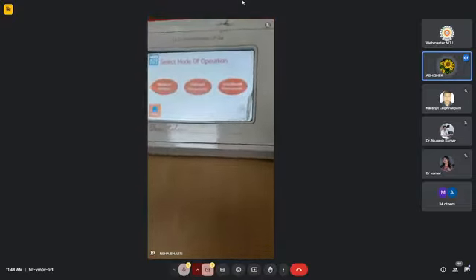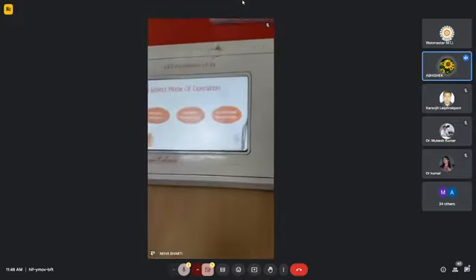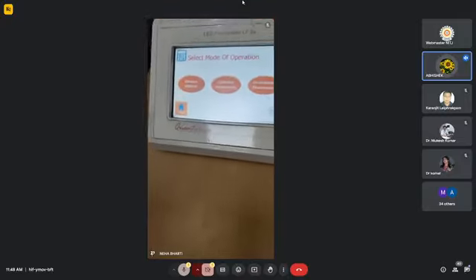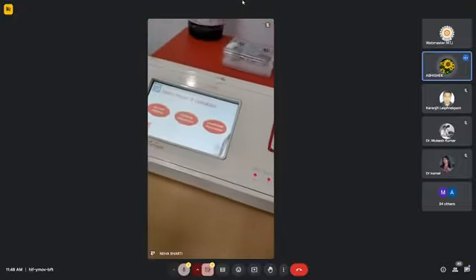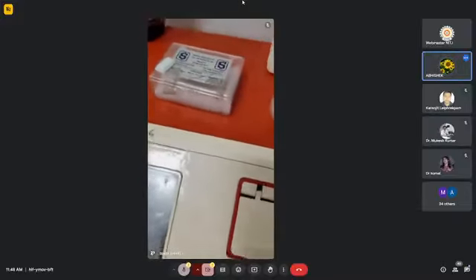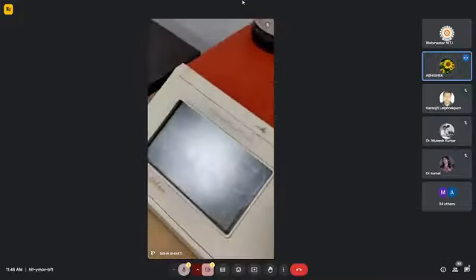Third is uncalibrated fluorescence mode, which displays the fluorescence from the sample, proportional to the uranium concentration, but the concentration itself will not be calculated and displayed. This mode is generally used when we have a large number of samples and want to know which of them show very large fluorescence. We generally prefer to use the calibrated fluorescence mode.